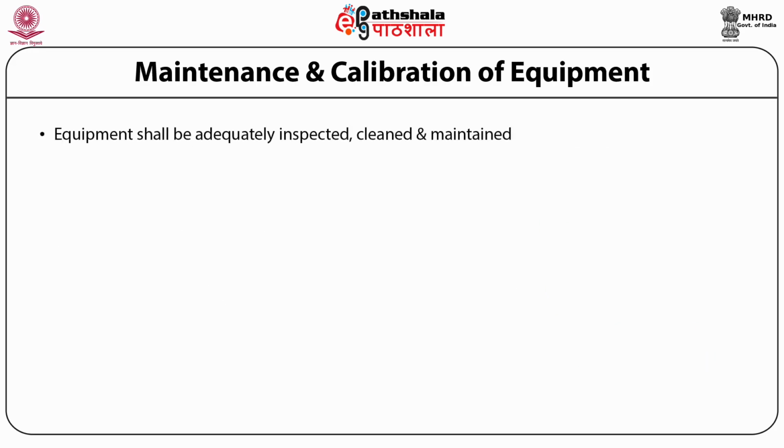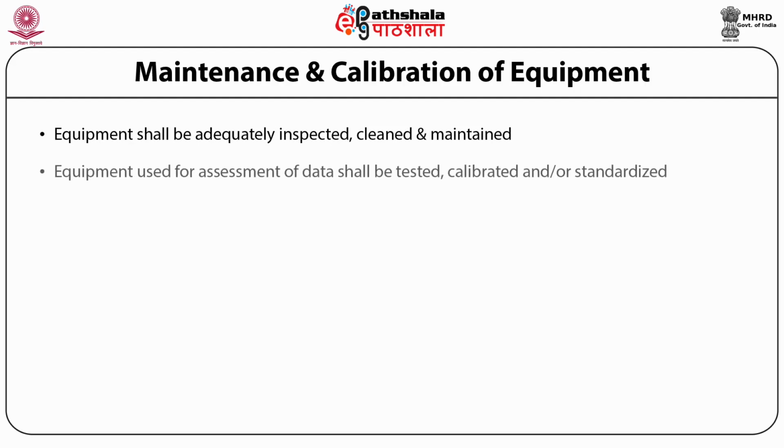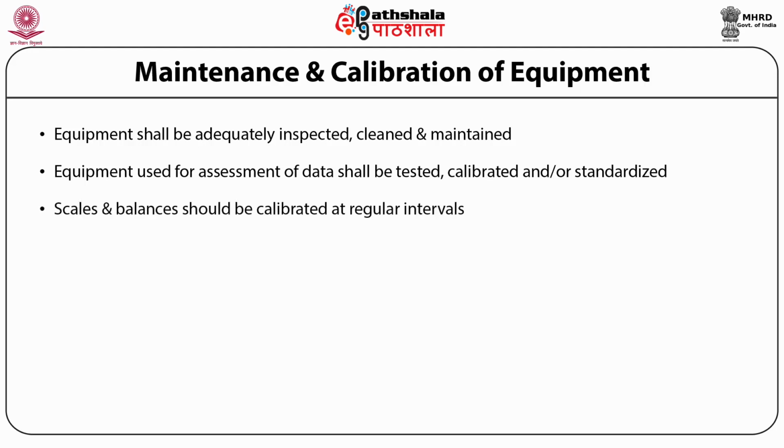Equipment shall be adequately inspected, cleaned and maintained on a regular basis. Equipment used for the assessment of data shall be tested, calibrated and standardized. The scales and balances should be calibrated at regular intervals.